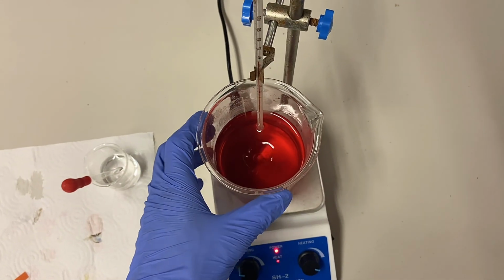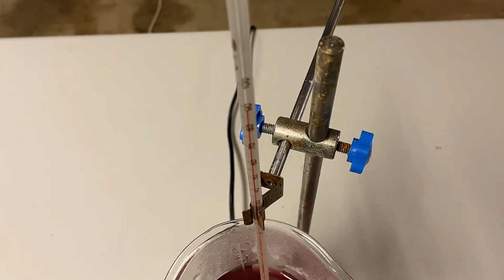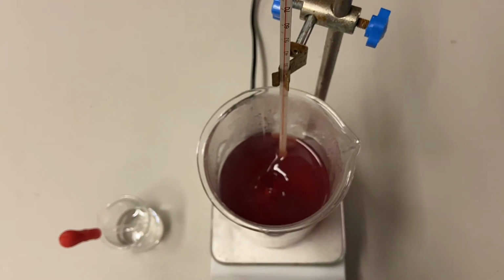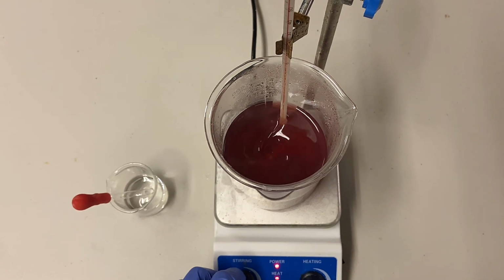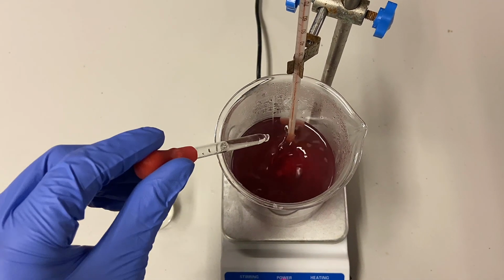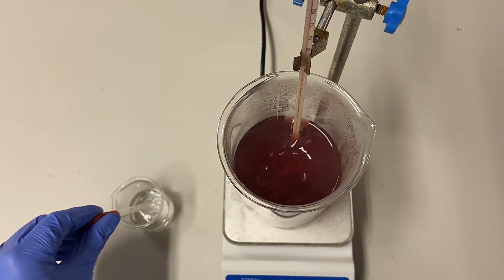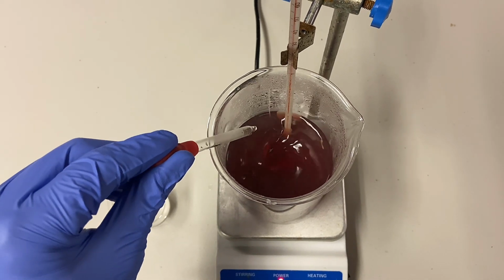But yeah, I'll check back in another couple of hours once this is at the right temperature, and we'll drop some of this in. And we are right at the 90-degree mark there. It's hard to focus the camera, and there we go. This has been heating for a good couple of hours and been stirring. So what I'm going to do is crank the stirring up a little bit. I'm going to drop in some of this oxidizer. Now off the bat, it won't really do anything. You're not going to see a big color change. I have to let it sit for a couple of hours at heat.